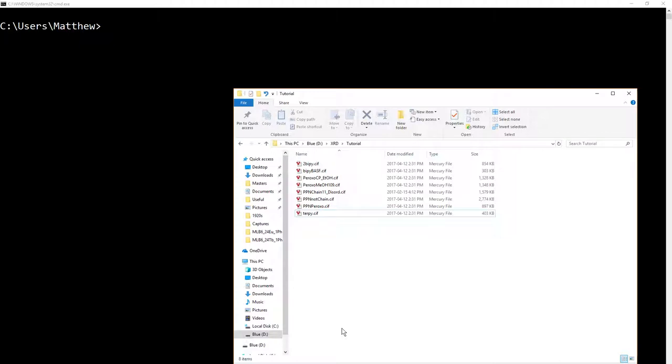This is a fast tutorial about how to combine multiple CIF files into one CIF file quickly using the DOS/Windows command line. I will also have versions for Linux and a combined one that shows Linux, Windows, and why not to use PowerShell for this.